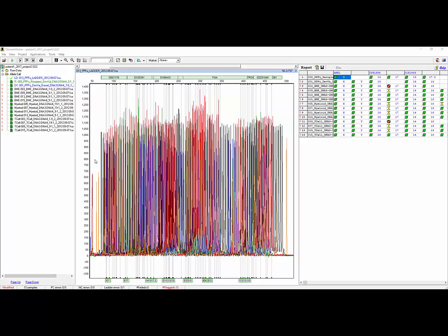One final thing I wanted to mention is many groups that are switching to ChimerMarker have longitudinal projects that they already have started and are ongoing that may be quite old. In some of those projects, it is possible that the original FSA or .HID files are no longer available for the donor and recipient samples. We often get the question, can those longitudinal projects still be analyzed in ChimerMarker even if the donor and recipient files aren't available? And the answer to that question is yes.